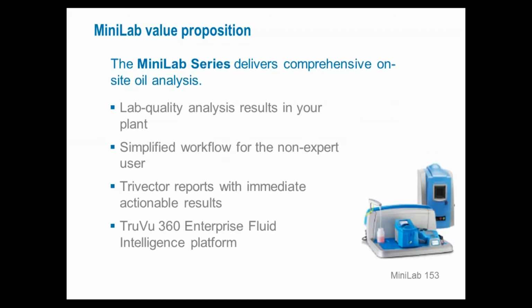So just a real quick snapshot of what the Minilab series is. The Minilab series is an on-site oil analysis system which delivers lab quality analytical results in your industrial site, in your plant, using this instrumentation. It provides simplified workflow for the non-expert user. There's no expectation that the operator is a chemist or an engineer. We don't require that for operation.